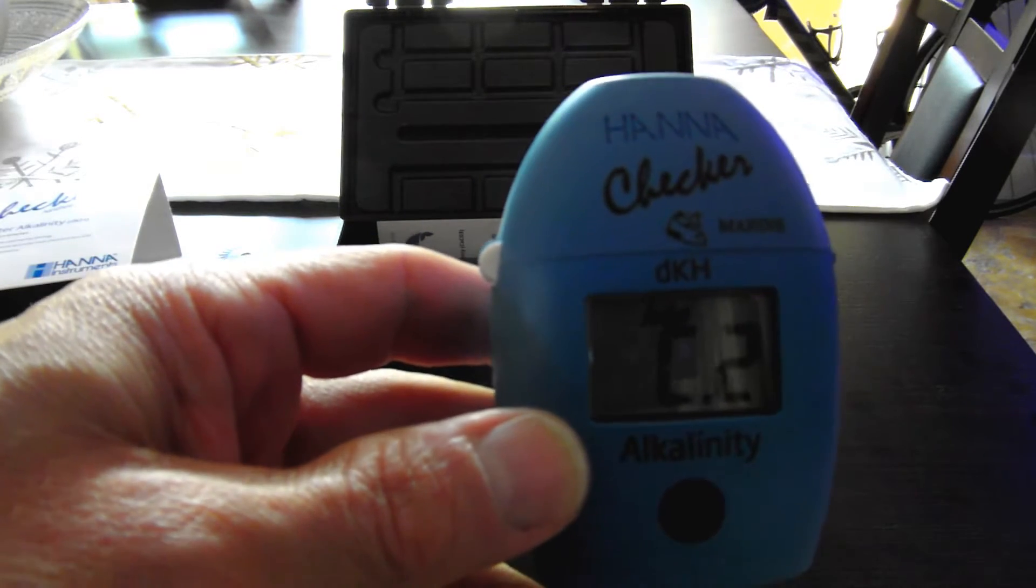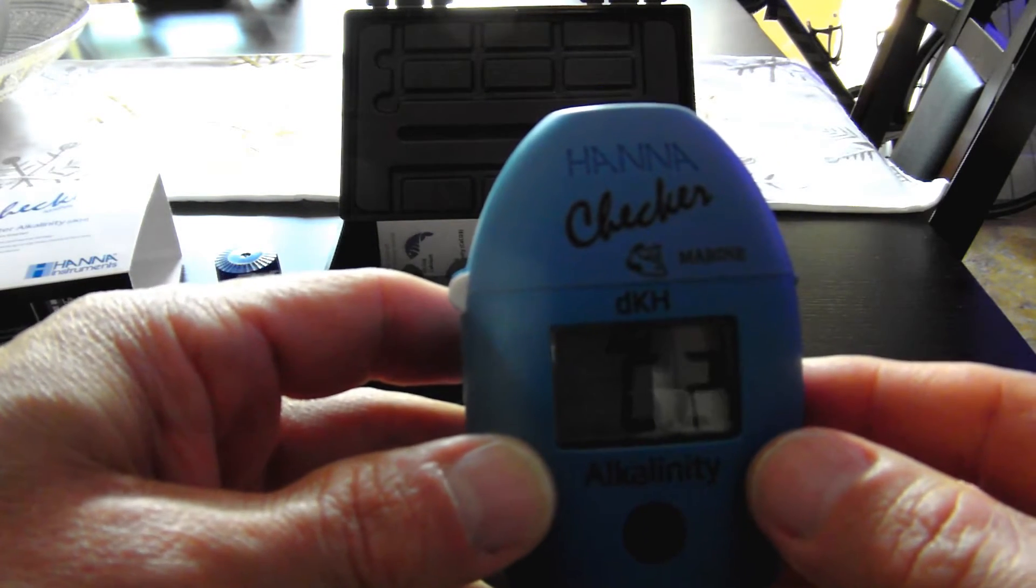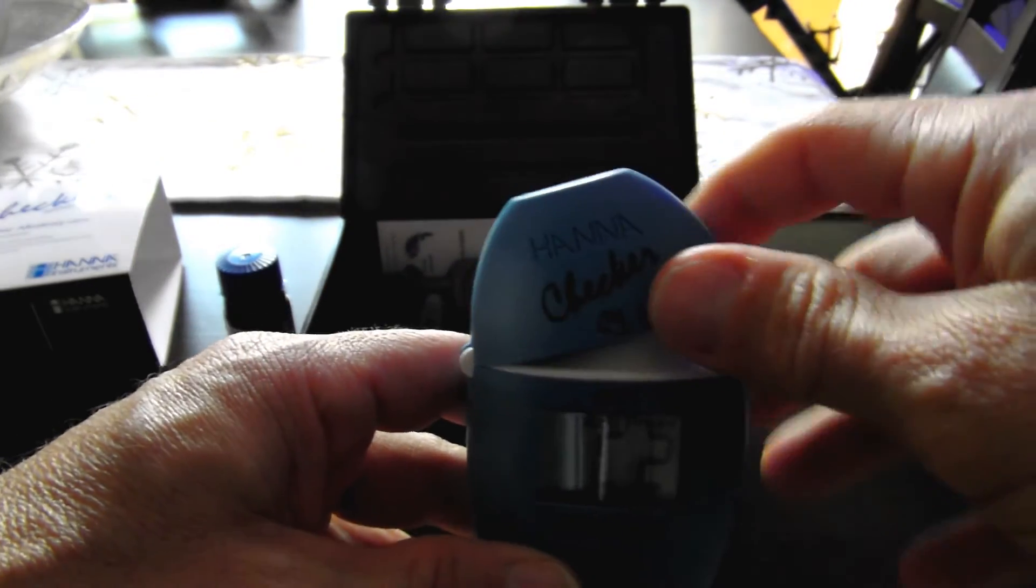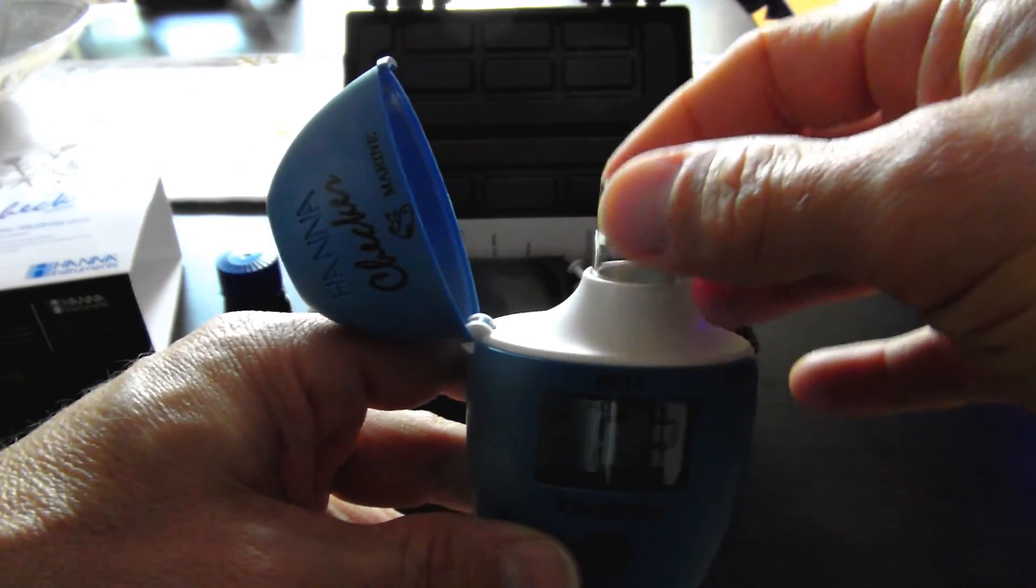This is zeroing the unit out. All right, now it wants C2, which means I'm going to add the reagent. I'll open up the lid and remove the cuvette.